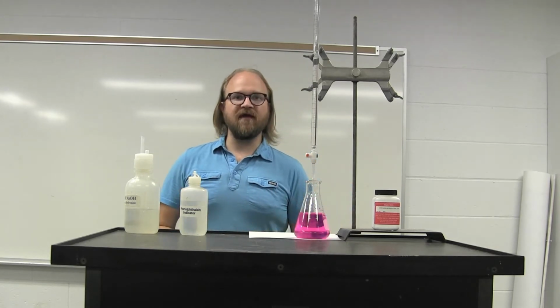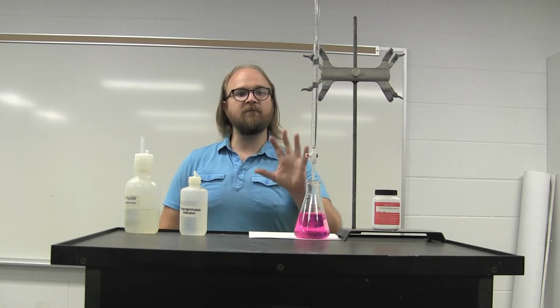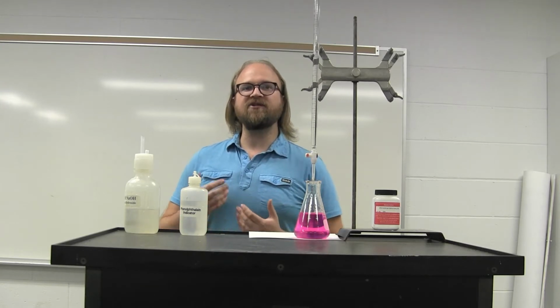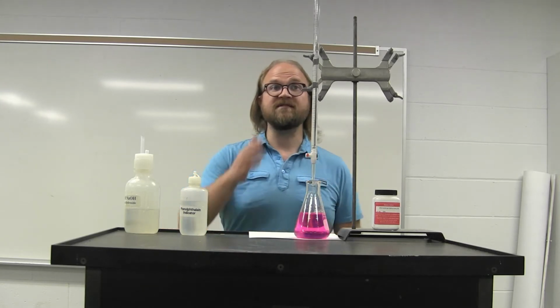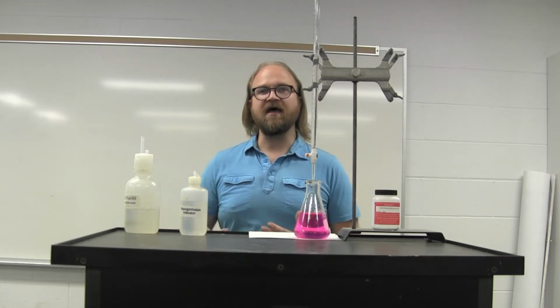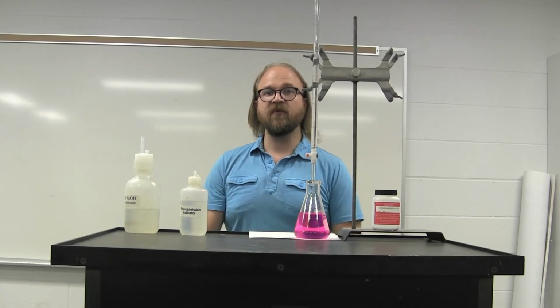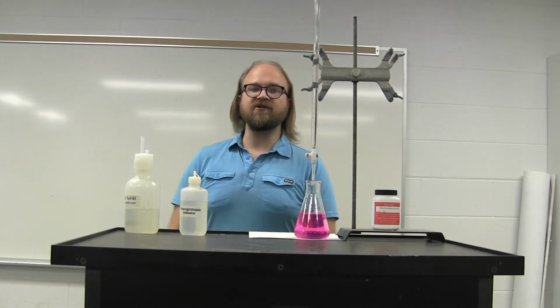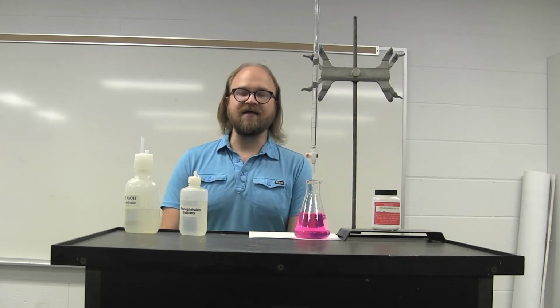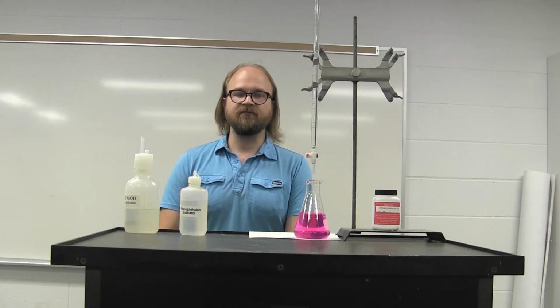This property that you're measuring could be a number of different things based on the chemistry itself. You could be measuring the change in absorbance as you're adding a solution. You could be measuring the change in conductivity as you're adding the solution. Or you could be measuring the change in acidity, or the pH, as you're adding the solution.